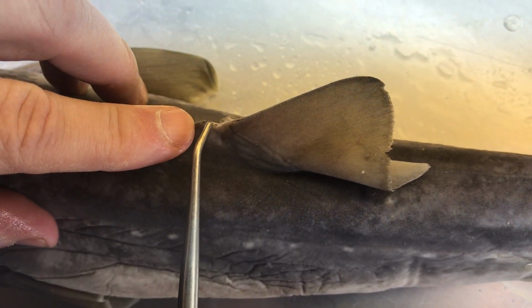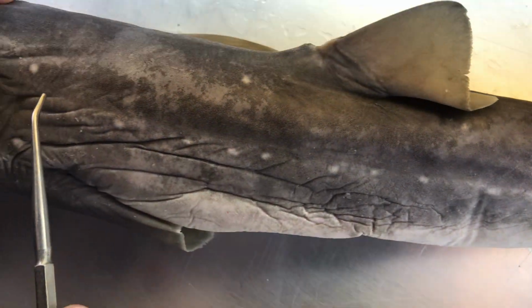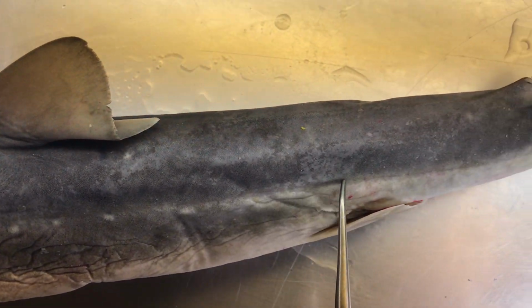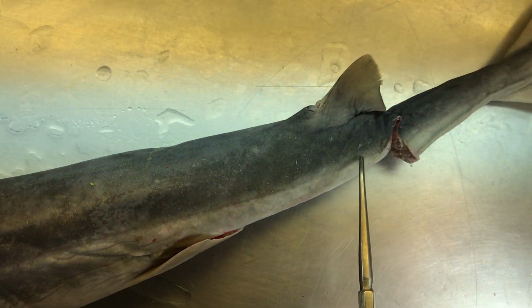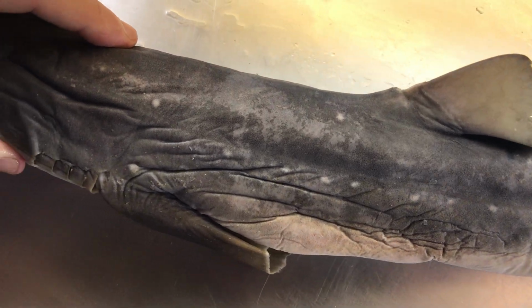What eats little sharks or bigger sharks. Also, they have a lateral line system here that runs down the entire length of the body. This is for mechanoreception, so they can feel the vibrations in the water.